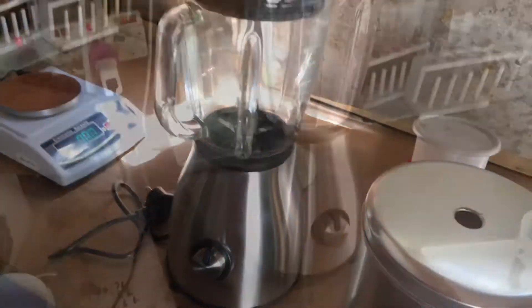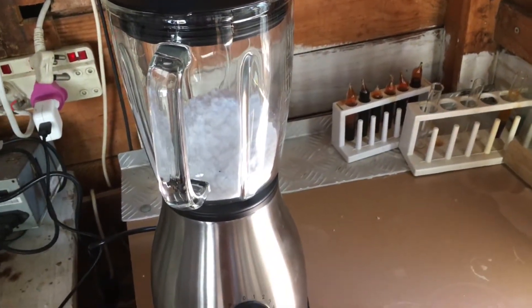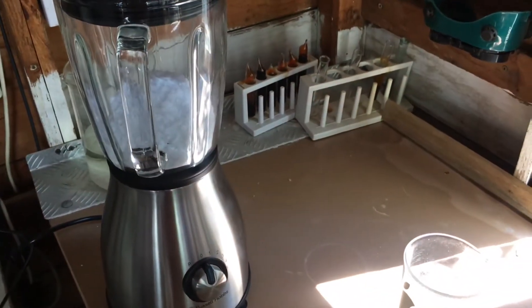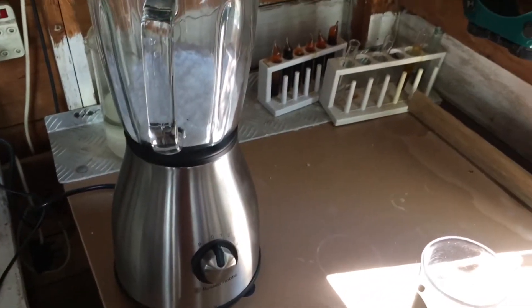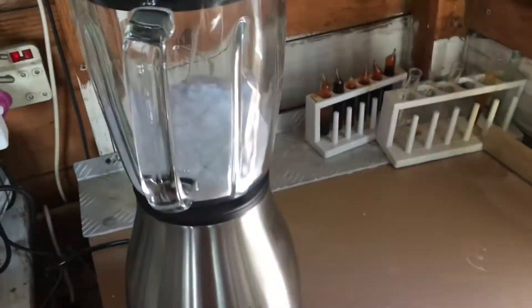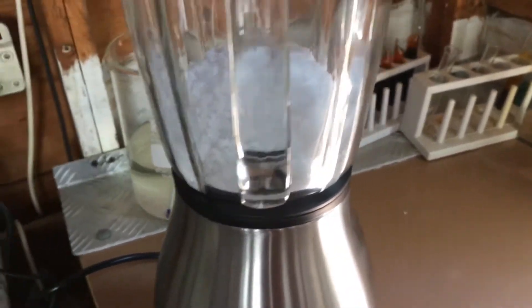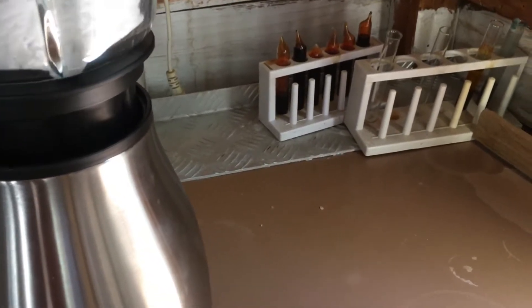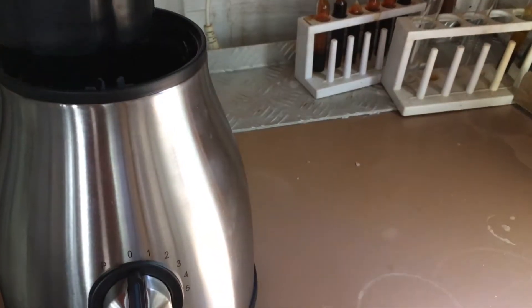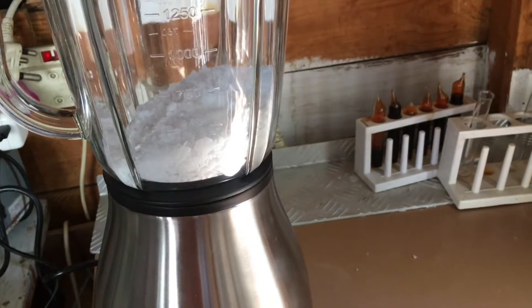It's important to wear a gas mask here because you're going to be creating a lot of sodium hydroxide dust and that can go into your lungs, so we don't want that. I've set up the blender and there's the 275 grams of sodium hydroxide. I'm just going to pulse it.